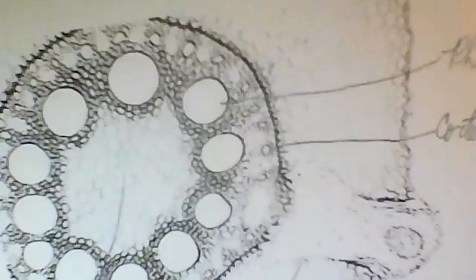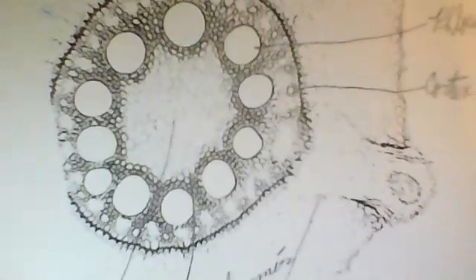And then endodermis, right here, going up. And then finally, last but not least, you got pith, which is right there in the center.